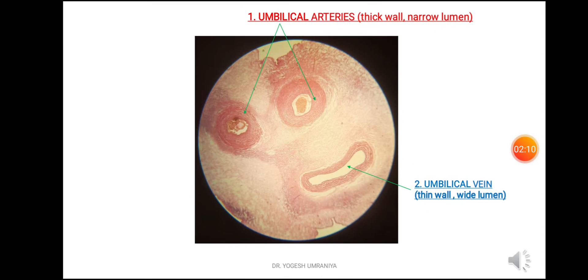This is the photomicrograph of the umbilical cord. In this field of the microscope you can see the two umbilical arteries, and within them you can also see the blood. The arteries have thick walls and the lumen is somewhat narrower as compared to the lumen of the vein. Number 2 is the umbilical vein, which has a thin wall and a wider lumen as compared to the umbilical arteries.